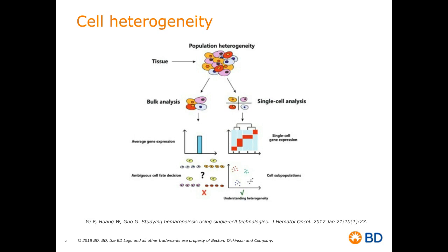And I will start from the cartoon shown here from a review from Ye et al., where the authors really nicely showcase the power of single-cell analysis when addressing important biological information about heterogeneous samples. If we start from a tissue or a sample that contains different cell types, so heterogeneous in nature, and a bulk analysis is performed, the readout and the information obtained are an average of the gene expression or protein expression of all the cells that form the tissue.